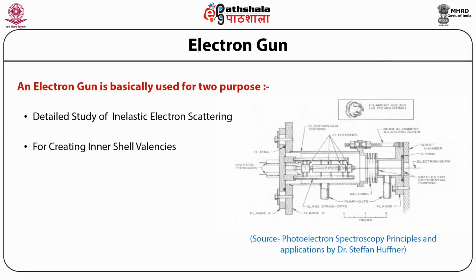The electron gun. In PES experiments, an electron gun can also be used in conjunction with X-rays to eject photoelectrons. There are a couple of advantages and disadvantages of doing this. With an electron gun, the electron beam is easily focused and the excitation of photoelectrons can be constantly varied. Unfortunately, the background radiation is increased significantly due to the scattering of the electrons.